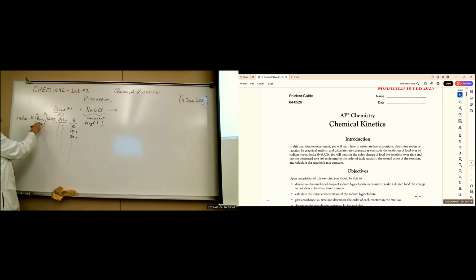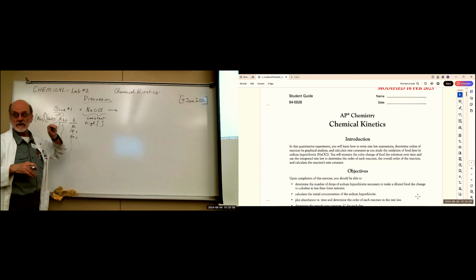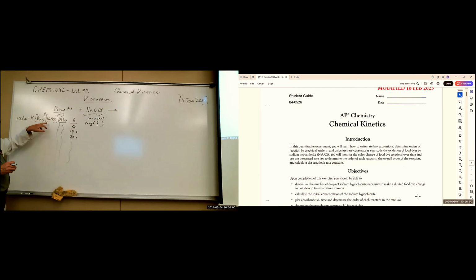So we're going to do this one first. We'll find out what that order is. So we can do that with 1 experiment. But in order to get a handle on what happens to this one, we're going to change the concentration. We're going to take half the concentration, which is still high enough, and read it again. Do the whole thing over again.